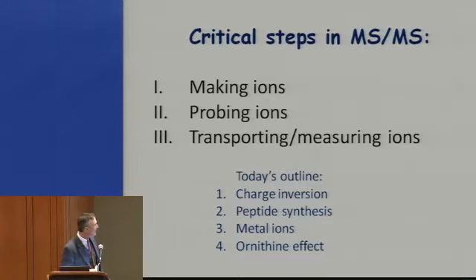So today, in this theme of selective chemistries, I'm going to talk about charge inversion a little bit. I put some slides in here for David Klemmer, because he and I have been talking about synthesizing peptides in mass spectrometers, so I have a little bit of that. I'll just mention a little bit about metal ions, and then at the end, somewhat speculative, an idea we're trying to pursue where we introduce weak spots into proteins so that when we do tandem mass spec on them, we can get enzyme-like cleavages so that we can do top-down fingerprinting of proteins. So we'll see what you think about that.